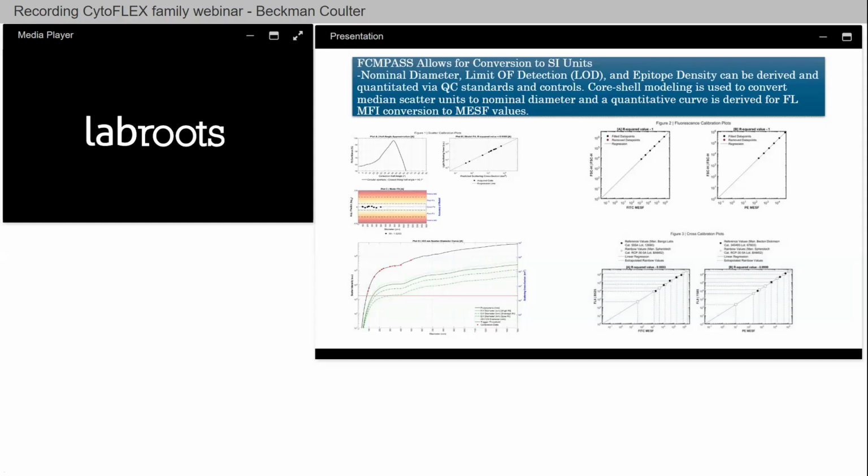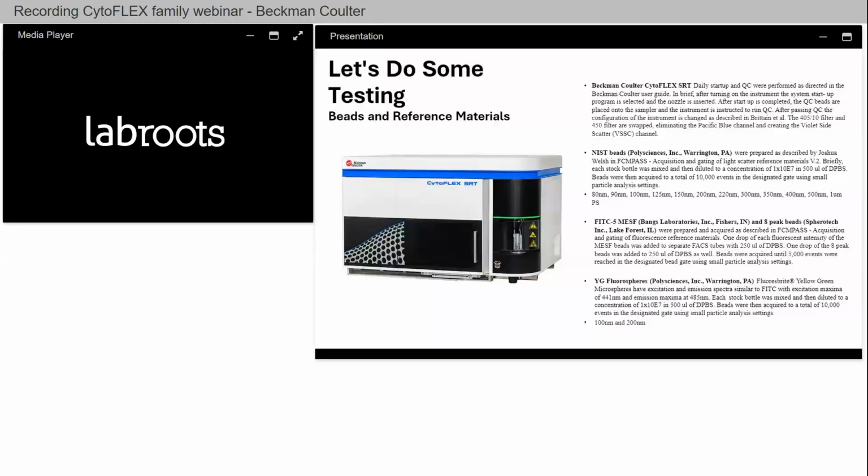Like I mentioned, Edward Vanderpool before, he does also have a very similar thing, all based on this Mie theory and the scattering properties of the particles. But let's get into what we all came here for, right? So let's step it up a notch and move into the actual sorting of particles.